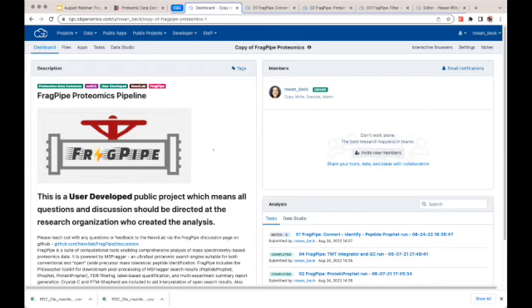A bigger update in the latest FragPipe, which might be related to CGC, is that we added a command line interface for it. Before, there was a GUI. Right now we have a command line, so it would be much easier for you to use the latest FragPipe, because you just replace the older one with the new one and then use one command line for it. And there are already several groups trying to adopt it in their own online server. I believe this might be the biggest update that is interesting to you.